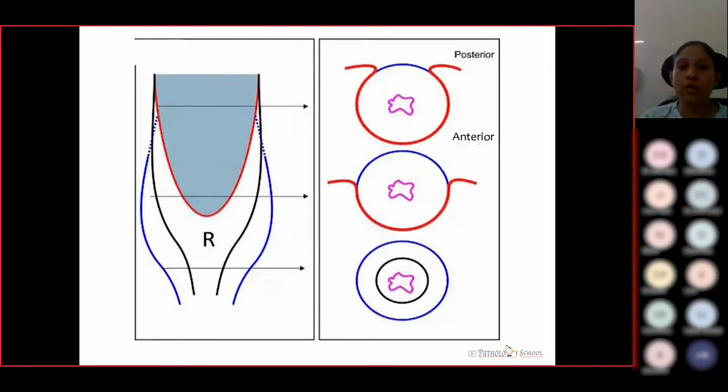This is important because the non-peritonealized surface is the one which we refer to as the circumferential radial margin. When do we call something a margin? Anything that has been bluntly or sharply dissected qualifies as a margin. So this non-peritonealized surface is a margin for the LAR and APR resections. That is why it is important to mark it.